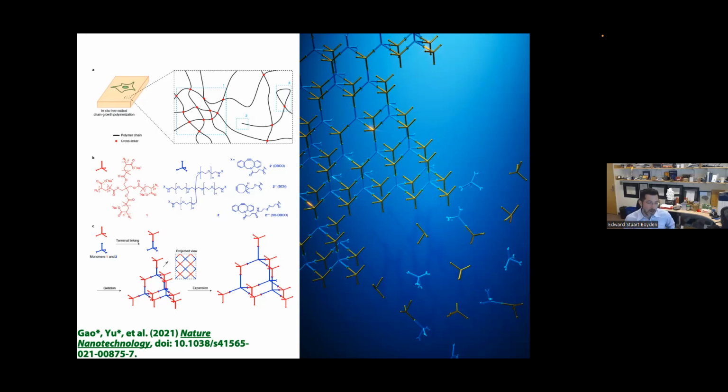Number two, in recent years, a second benefit is becoming clear. By decrowding things for labeling, we can improve the labeling. And sometimes we convert invisible proteins or even invisible cells into visualizable form. Now, thirdly, looking forward, what's next? Well, one question is, how big can you expand, or how good can the resolution be? So when we expand twice in succession, the 20-fold expansion I mentioned earlier, a 300 nanometer resolution lens would now have a resolution of around 300 divided by 20, about 15 nanometers or so. Can we do better?